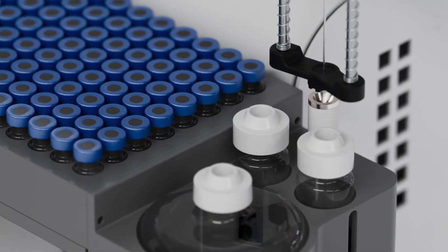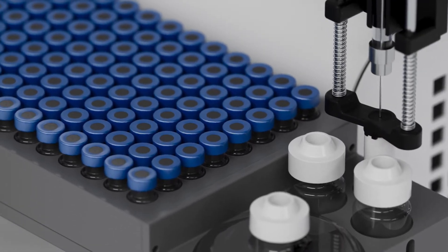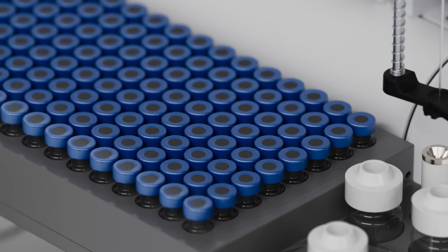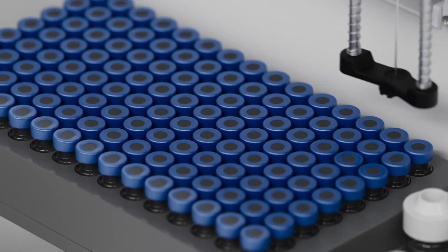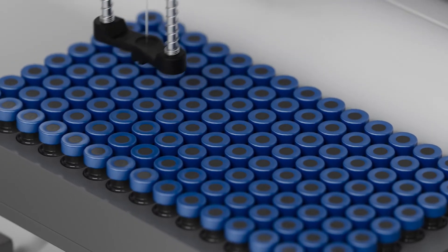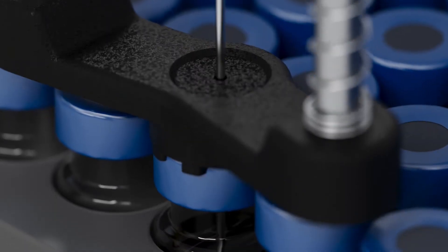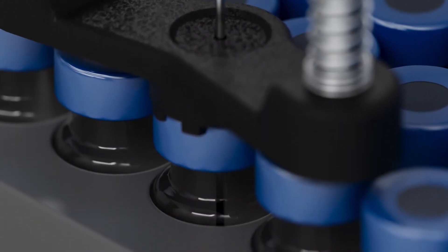With the one cal feature in our Nexus link software, the AS120 can automatically make a full calibration line out of one stock standard with the highest accuracy. It also features enhanced sampling capabilities with cooled and heated sample trays for handling highly volatile and viscous samples.